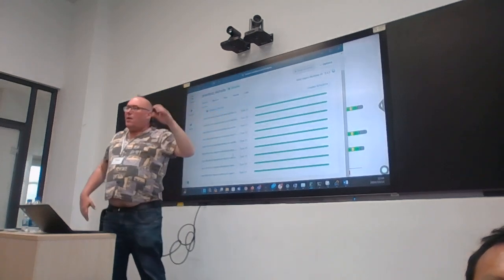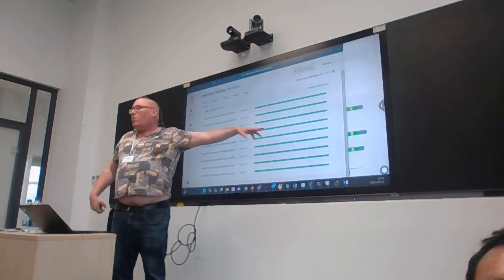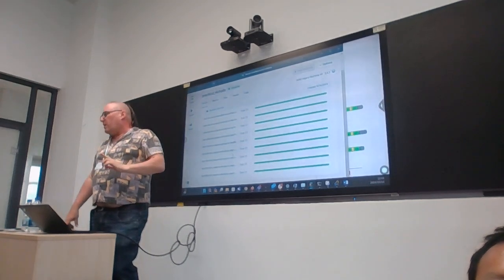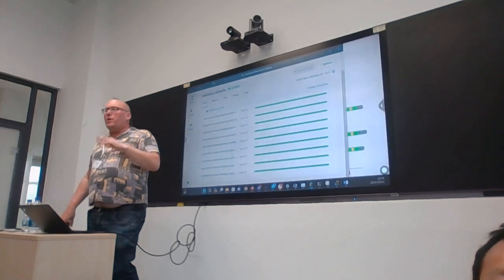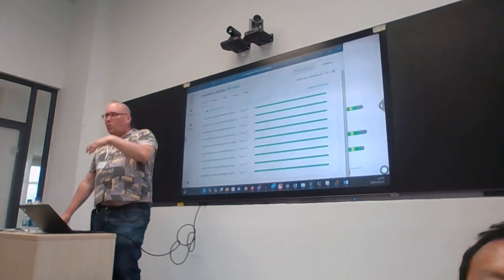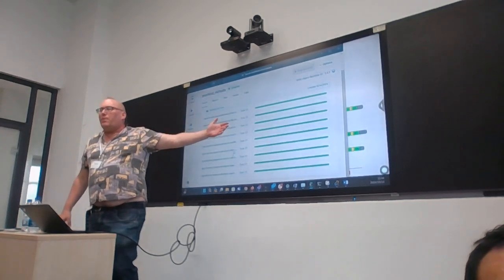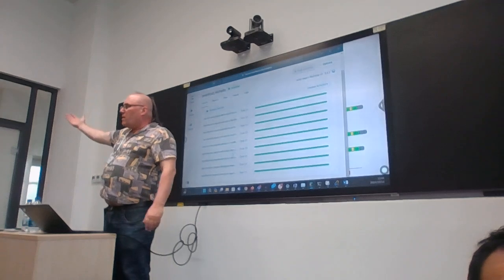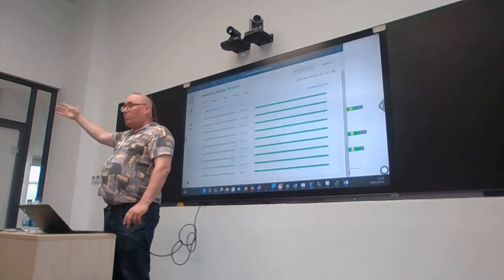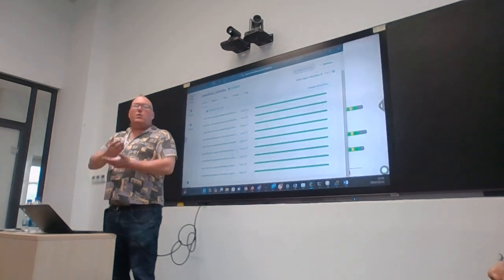But this Epi2Me environment can run more than one workflow. We're just focusing on the one workflow for today. One of the advantages to getting this set up in all of your labs is that in the future, if you need to do training on something else, you will already have the software set up, and we can then say we want to analyze yellow fever virus. Here's a workflow, run it in Epi2Me. You want to do Mycobacterium tuberculosis? Here's a workflow for you.